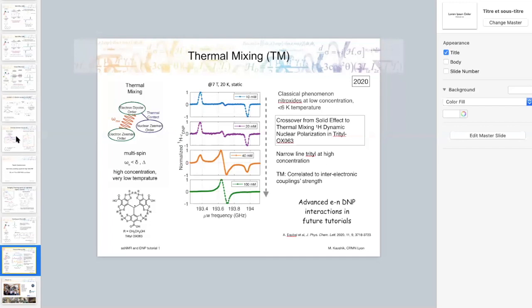Okay, there's a clarification. They mean that if the nuclei are the same type of nuclei, but at different sites in the molecule, will they have the same enhancement? That depends on the distance from the polarizing agent and on motions. If one of the domains, for example, is more mobile, then it would have lesser enhancement as compared to the one that is rigid.